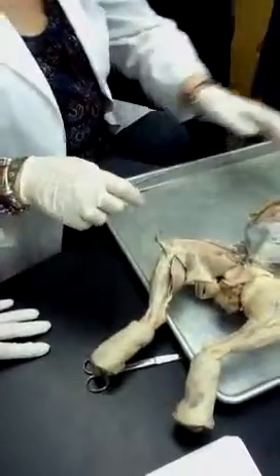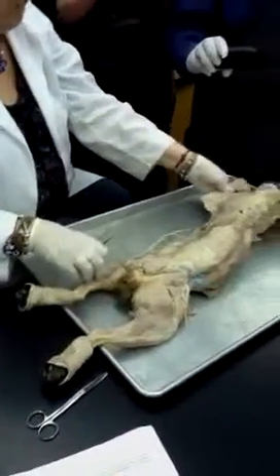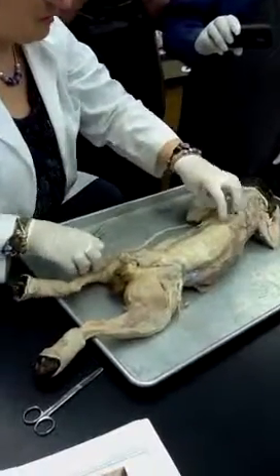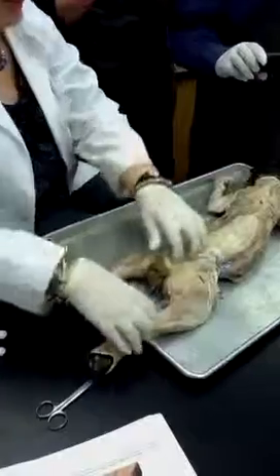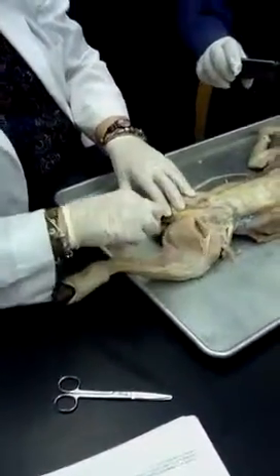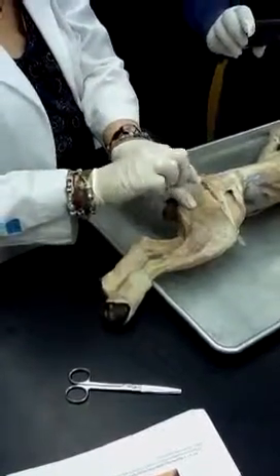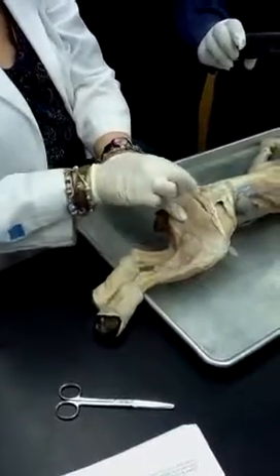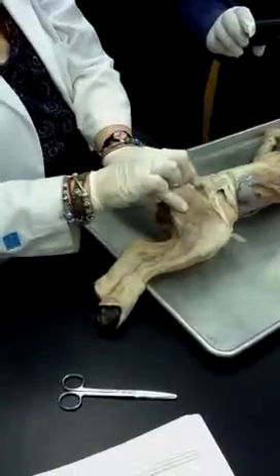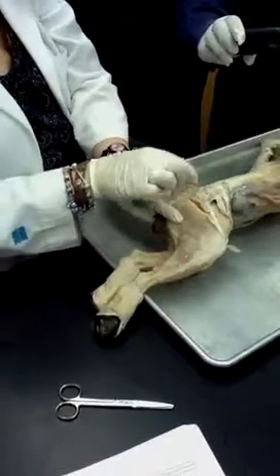All right, let's flip them and see how we are at posterior. The tail is interesting, but we haven't dissected it all. We can just do this thigh here. We have the biceps femoris, and then the caudofemoralis, gluteus maximus, and gluteus medius. Look for the caudofemoralis because it's strap-like, as your landmark, and then go gluteus maximus, gluteus medius.